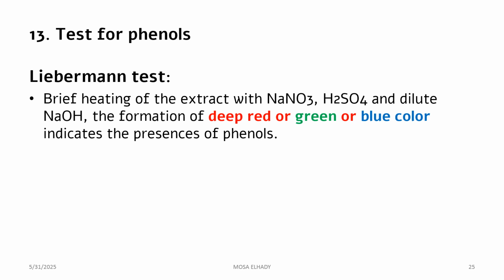The second test for phenol is the Liebermann test. The Liebermann reagent consists of sodium nitrate, sulfuric acid, and sodium hydroxide. With heating of the extract, we note the formation of deep red, green, or blue color in the test tube. That means the extract contains phenolic compounds.